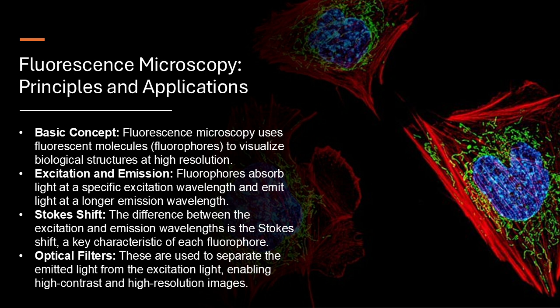That's so cool. And these sensors are becoming incredibly sophisticated. Some can even change color in response to specific molecules, allowing us to track the movement of those molecules within the cell. So it's like having a color-coded map of the cell's internal communication network. Exactly. We can see how information flows within this bustling metropolis of molecules.